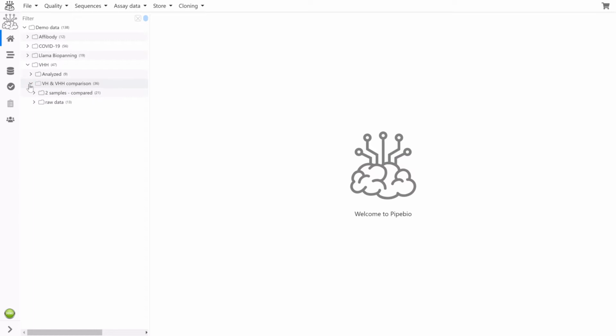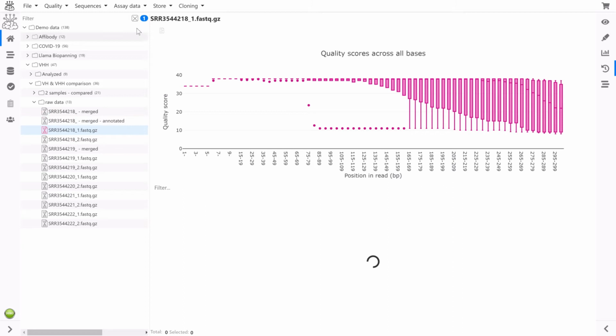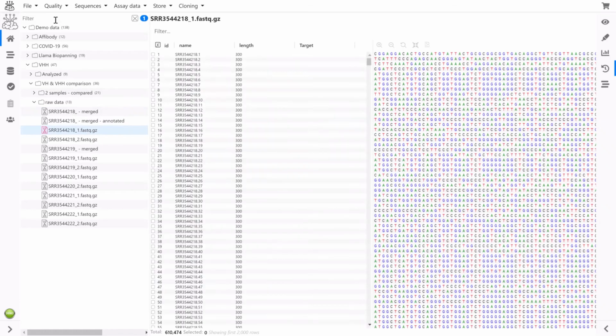Navigate to your folders and documents and select one document. Use the controls on the top of the folder tree to see how many documents you have selected and clear selections. There is a context-sensitive tool strip where you have access to all the functionalities in the platform. Each tool has a small tooltip associated so you can see the functionality.